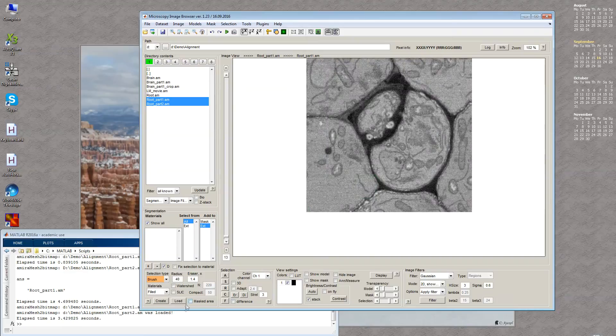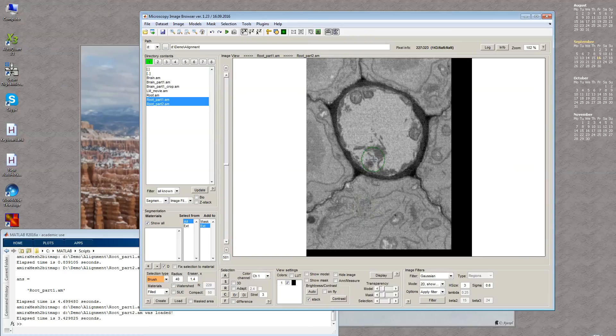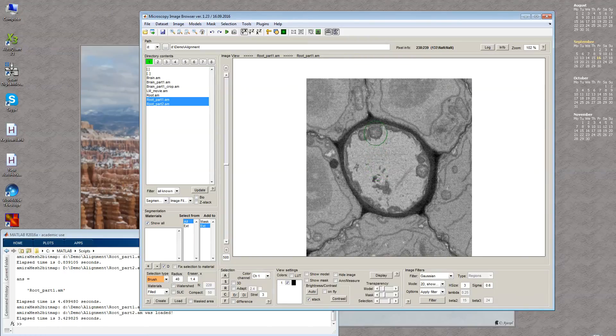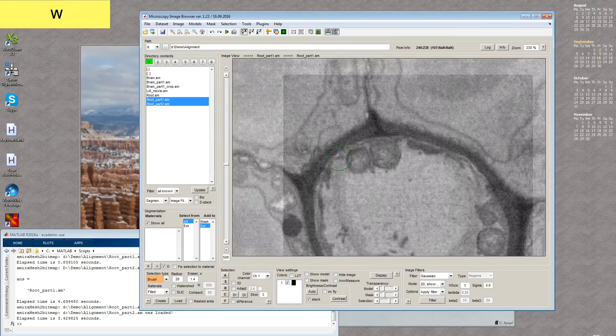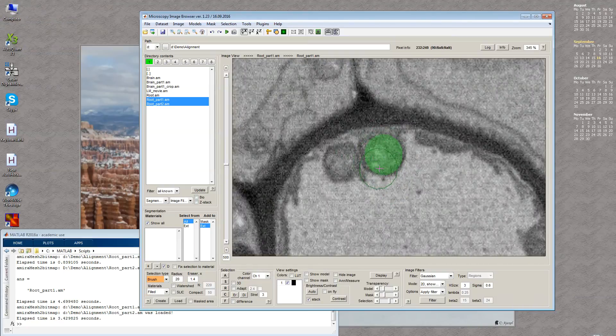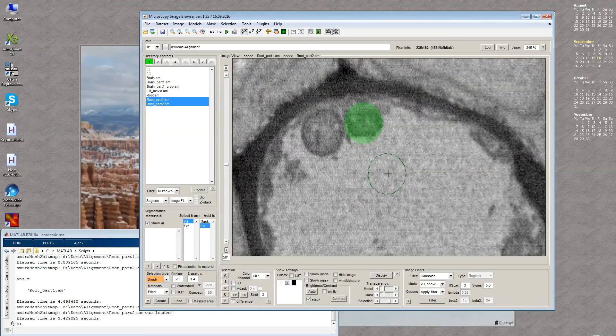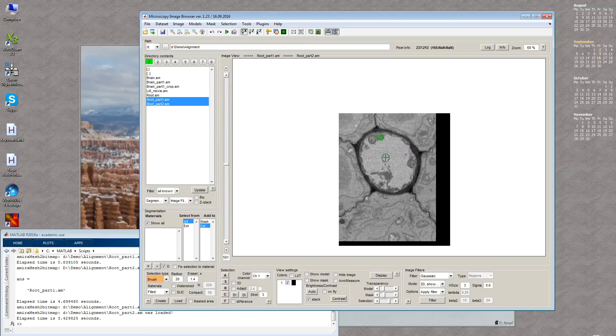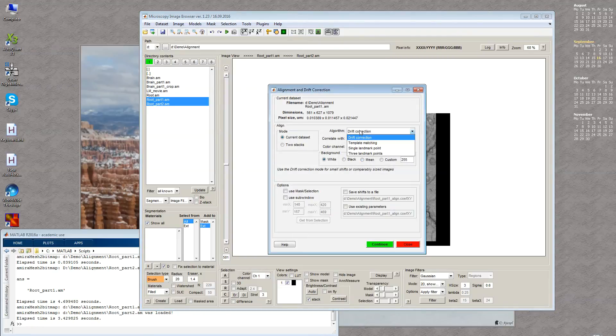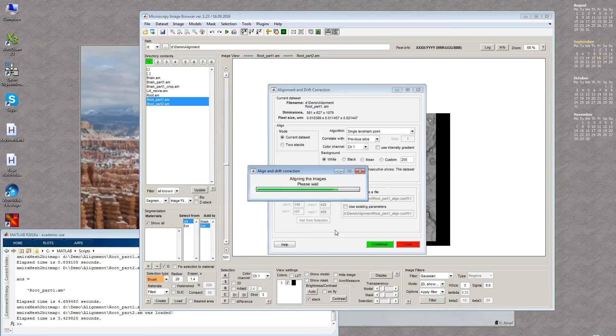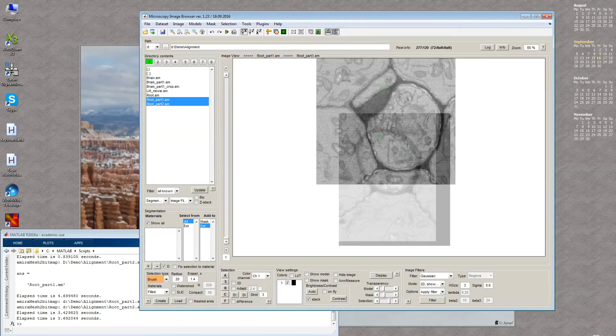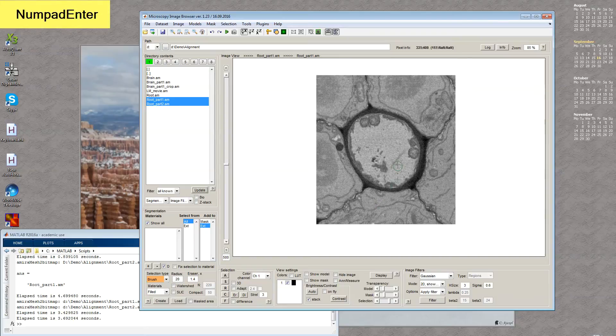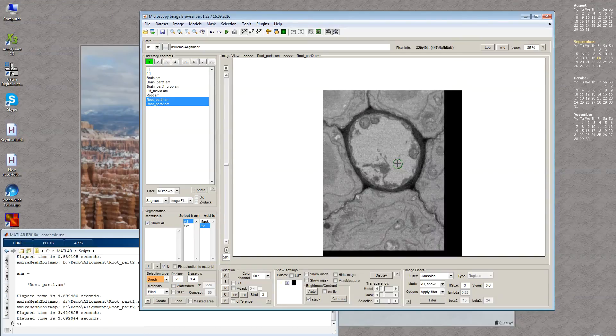If I load them together and go to slice 500, you can see these two datasets are shifted against each other. To match them manually I can select similar features on the two sections. For example, I can select this mitochondria and the same mitochondria on the second slice using this selection shown in green. Then we go to Dataset Alignment, select Single Landmark Point mode, and press Continue. It will use these two points to shift datasets against each other. Now we're at slice 500 and you can see they are fairly nicely aligned.